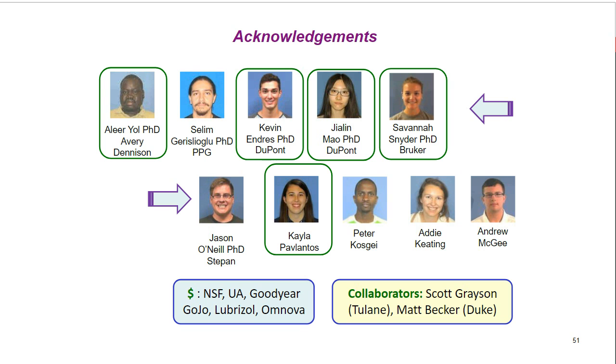So if somebody comes to you and says, I want to know the average molecular weight of my polymer, and the distribution of the polymer is broad, then tell that person to use GPC for that. But if that person came to you, the synthetic chemist or synthetic polymer scientist, and told you, I want to know what end groups my polymer has, by all means, run the MALDI-MS spectrum. Whether it's broad or narrow, it doesn't matter.